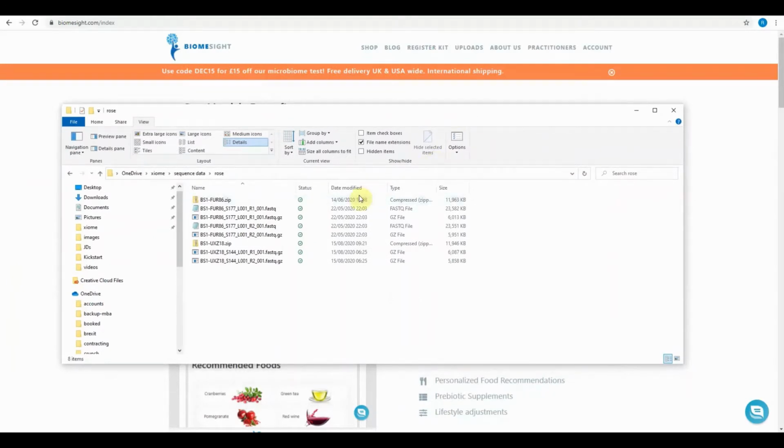We currently support uploads of specifically 16S data from a number of labs. These labs are Thrive Inside, Ubiome, Olawal and Somagen. Please note that we do not support the uploads of shotgun data. Somagen also have a shotgun test, which we don't currently support.